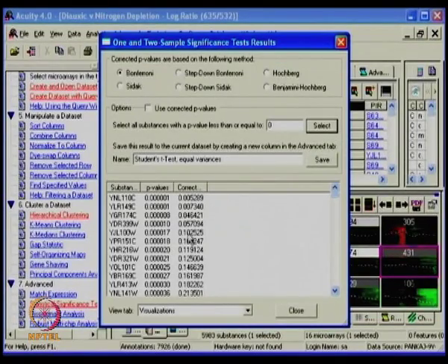Another important thing is multiple testing corrections. It also gives an opportunity of correcting using different correction types, for example Bonferroni, Holm, Benjamini-Hochberg. So they are different ways of correcting for multiple tests. You can apply different ones and look more. Preferably Bonferroni, which is the more stringent type. Benjamini-Hochberg is a little more lenient on the multiple correction.